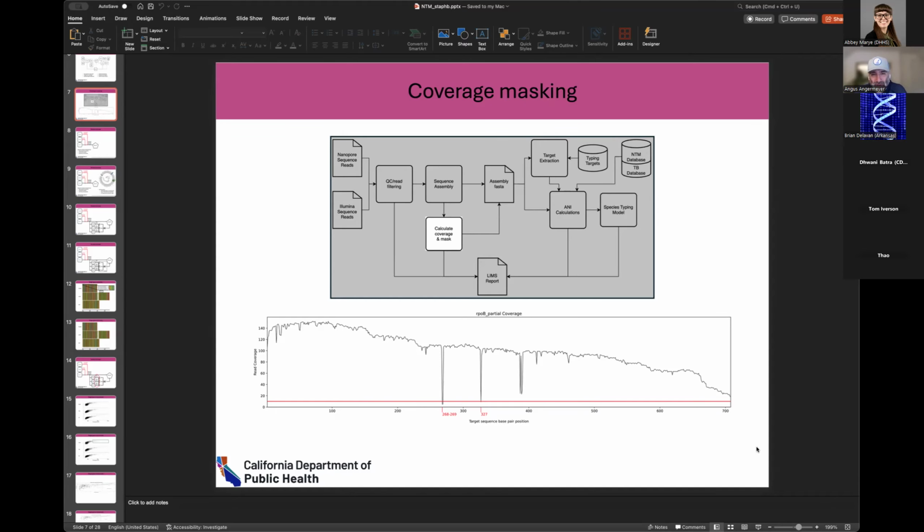This doesn't happen very often. I'm only seeing this in like 5-10% of some of the samples of lower sequencing quality. Usually it's just not an issue, but it is a good point. There are 1,000 little things like that I kind of have to make some assumptions about. So for the moment, that's kind of where I am, and I would like to hear from others too, like what they think about the interpretation of this 10x cutoff.